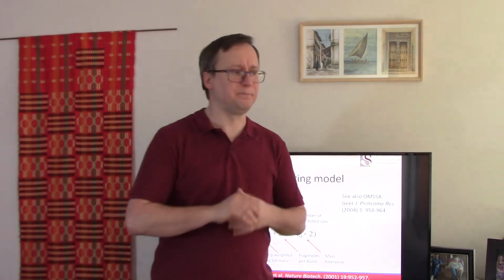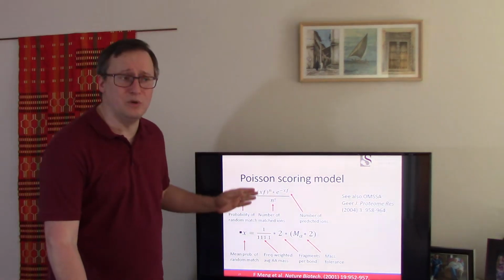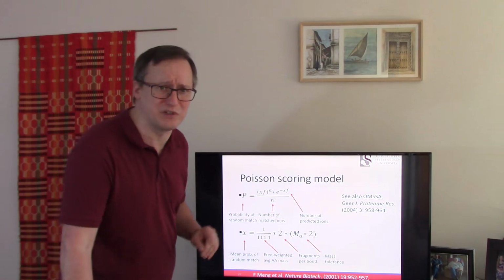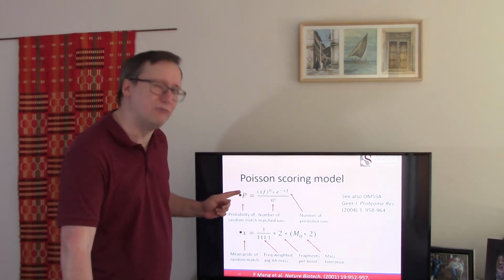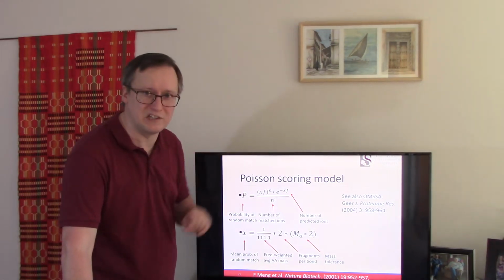The notion being, if you have some protein, you can consider all the fragments that should be produced by it, and then ask, which of these fragments do I have experimental evidence of in my tandem mass spectrum? Okay, so we have our last 2 equations for today. I hope you'll tolerate this for just a moment. What we're trying to compute is P, the probability that by random chance we would have a match this good for this sequence and this spectrum.